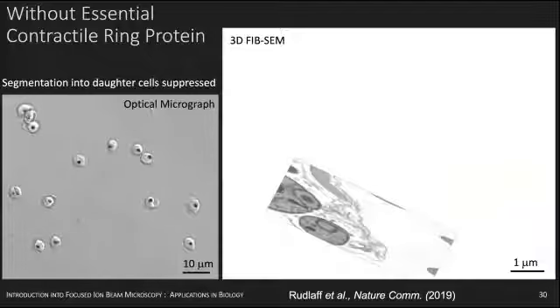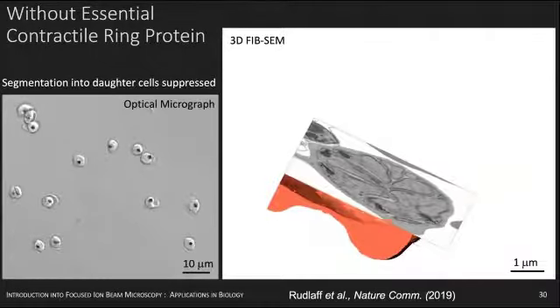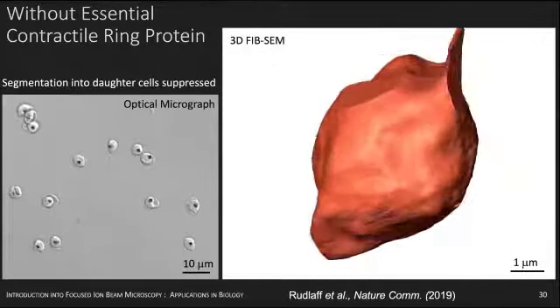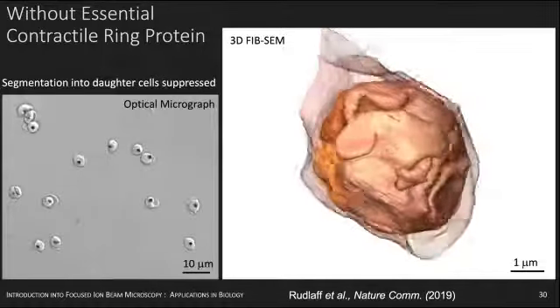And so that is where we again used focused ion beam microscopy. This video shows first the sequence of the SEM images. You see how the blood cell evolves, and then we are slowly moving in from the blood cell into the parasite, and then peer into the parasite. You see here the starting raw material data, the images, and Rachel has then segmented the information into the relevant objects. Here you see the blood cell, and then the parasite.